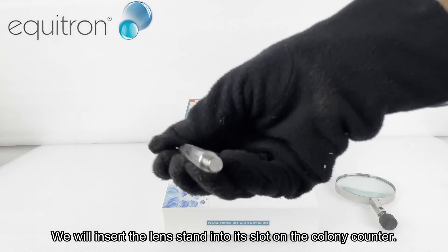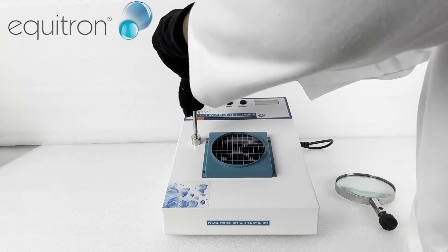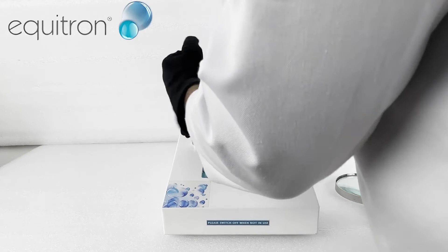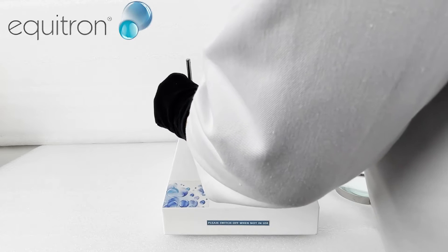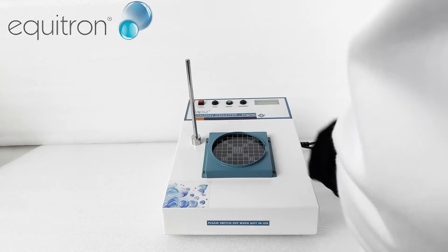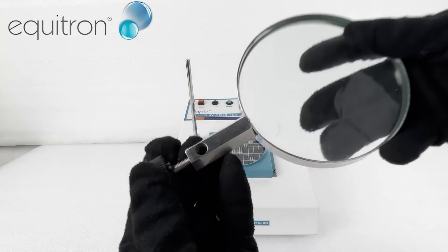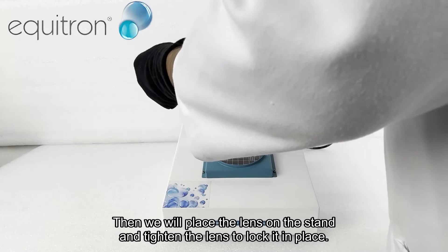We will insert the lens stand into its slot on the colony counter. Then we will place the lens on the stand and tighten the lens to lock it in place.